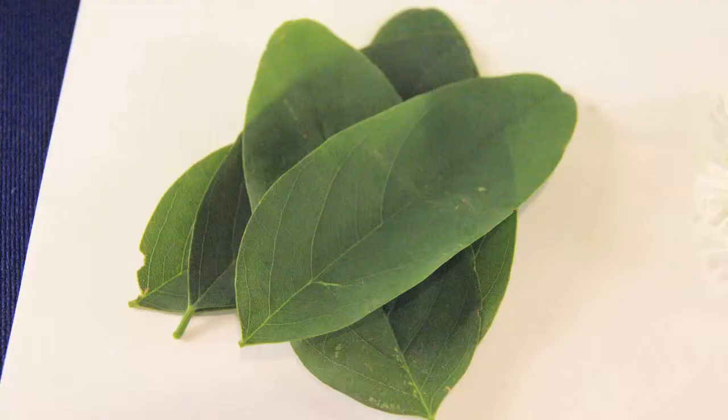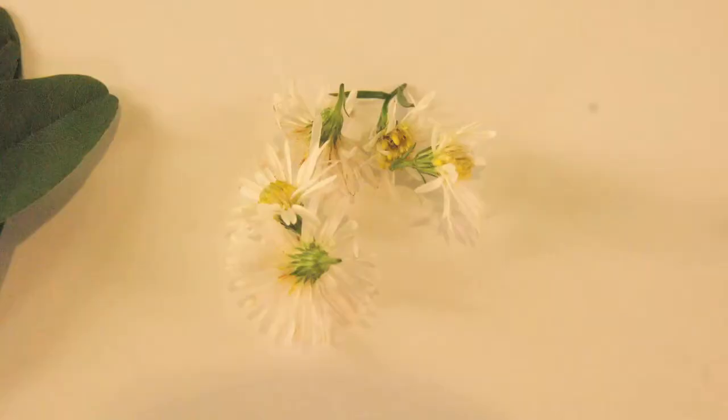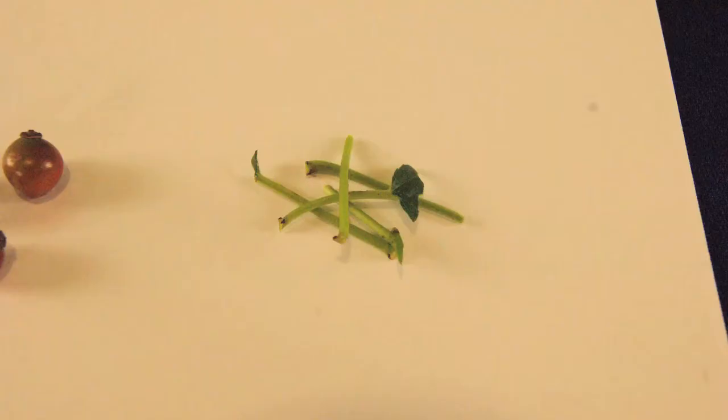Examples of plant tissues that can be homogenized in the Bullet Blender are leaves, flowers, fruits, and soft stems.